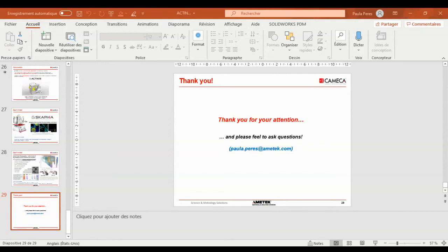And last question I have here, the typical procedure to move the samples from the shipment carrier pig into the ACTINIS and the handling tools that are compatible. So for now, what has been done in CEA is based on their installation, what they have. They have a hexagonal cell. If you see the 3D view of the ACTINIS, from one of the sides there is a connection to a cell, there is a tube simply, and the sample is coming from another cell going directly into the glove box. But of course, this is something that may be different from one lab to the other. We would need to see. But in CEA, this is how it's happening.